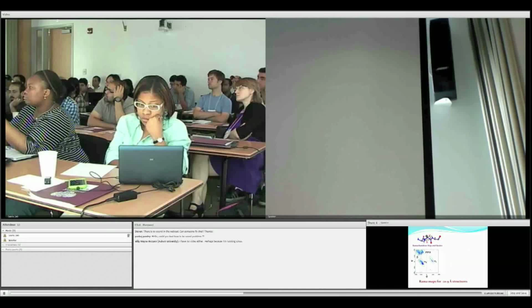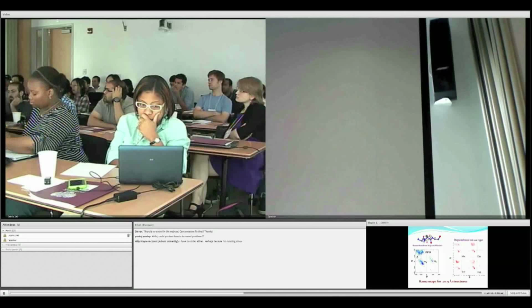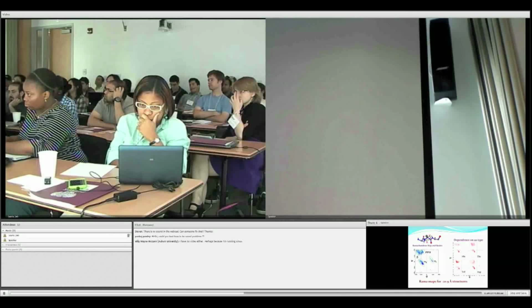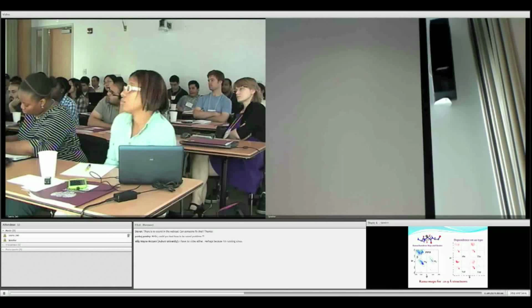Ramachandran was the first person who came up with this, and this is due to steric and electrostatic interactions. So basically, we have four basins. We have the extended basin, which has the beta and the polyproline 2. We have alpha right and alpha left. And these are some of the structural samples of these four different regions.